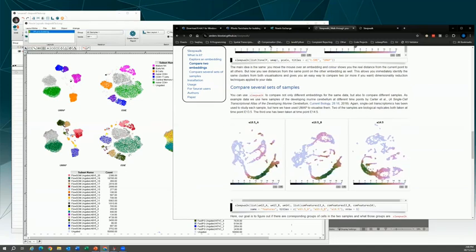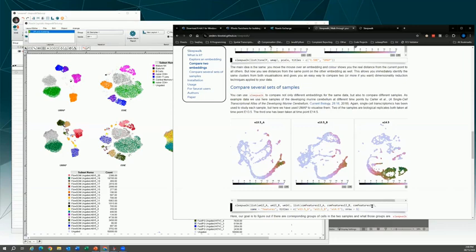This one doesn't have the same embedding, so it makes it a little bit harder to interpret. But with UMAP, like I was saying, there's that apply on map. So you could get all the samples onto the same embedding and then split them apart based on these samples. And maybe the samples are different stim conditions, and you can view the results that way.